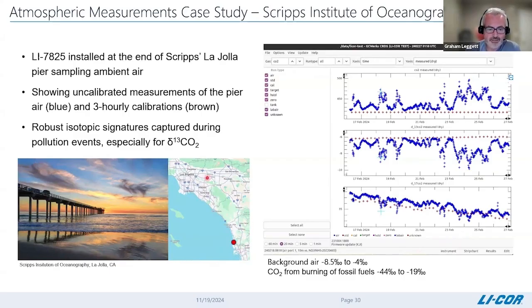So there's a lot of potential here for combustion and fossil fuel sources of CO₂ emissions. That's what this group is interested in: measuring CO₂ concentrations long-term, but also attributing any pollution events to particular locations based on wind speed and direction and isotopic measurements.